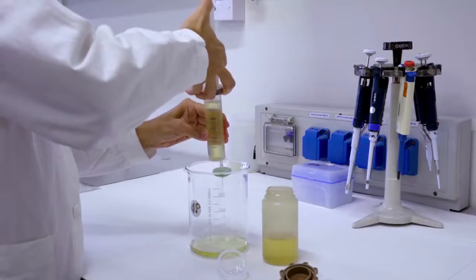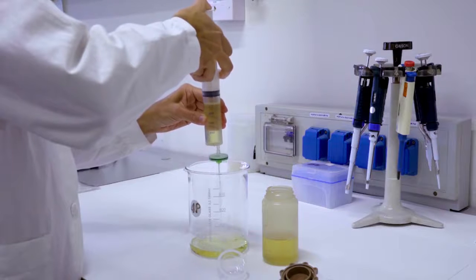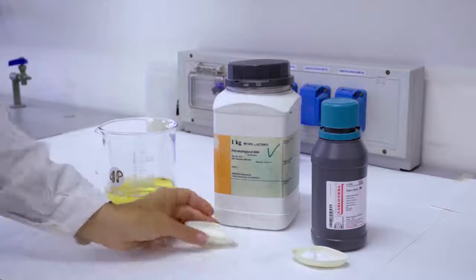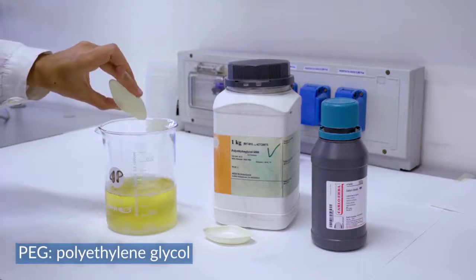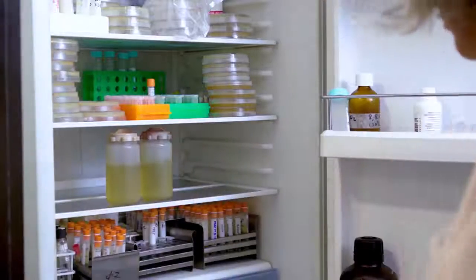At the end of the centrifugation, filter the supernatant through a 0.8 micrometer pore diameter, and add 58 grams per liter of sodium chloride and 105 grams per liter of PEG 6000. Incubate the solution at 4 degrees Celsius overnight.